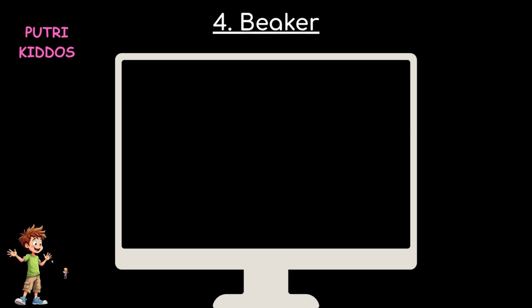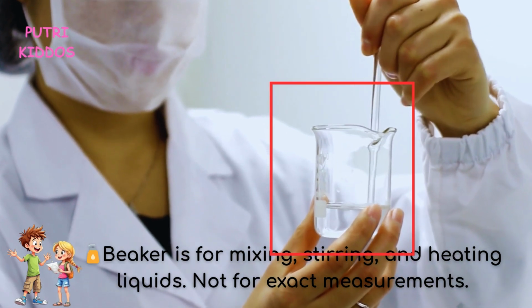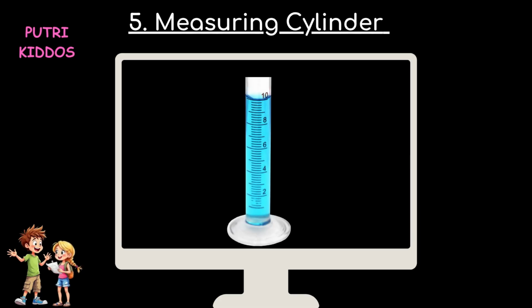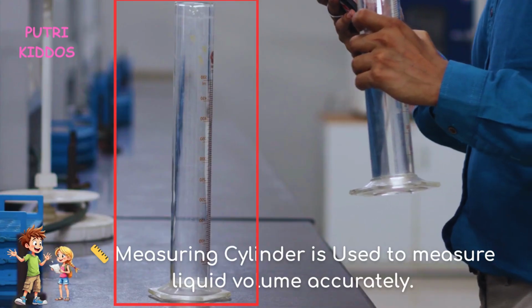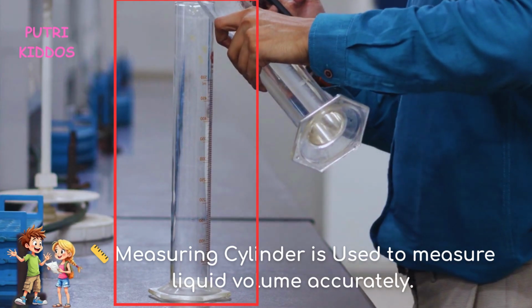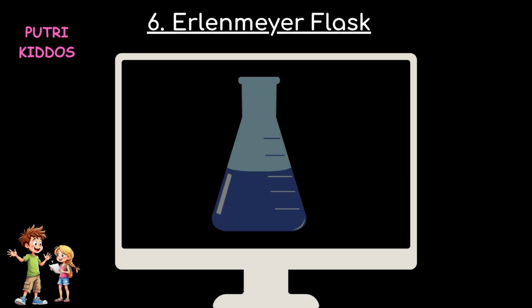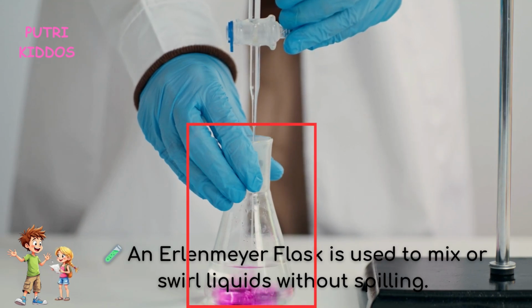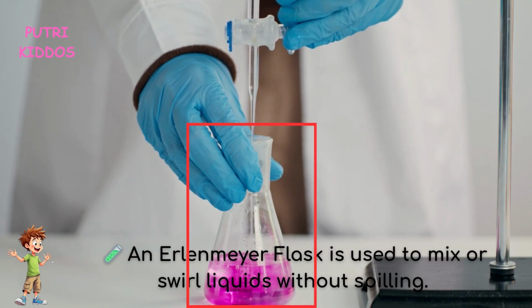4. Beaker. A beaker is for mixing, stirring, and heating liquids, not for exact measurements. 5. Measuring cylinder. A measuring cylinder is used to measure liquid volume accurately. 6. Erlenmeyer flask. An Erlenmeyer flask is used to mix or swirl liquids without spilling.